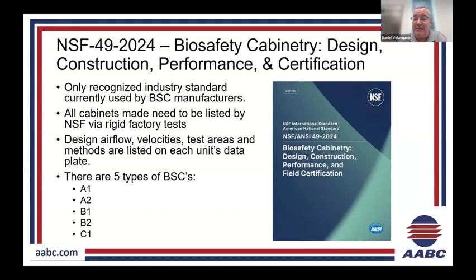For their cabinets to be listed, to have the little blue NSF logo on their devices, they have to submit them and their engineering information to NSF, and then NSF does a mountain of factory tests on them. Velocity testing, particle testing, tracer gas testing, decay testing, tip testing. One of the important revisions is that the design flows, velocities, test areas, and methods are all listed now on the unit's data plate.